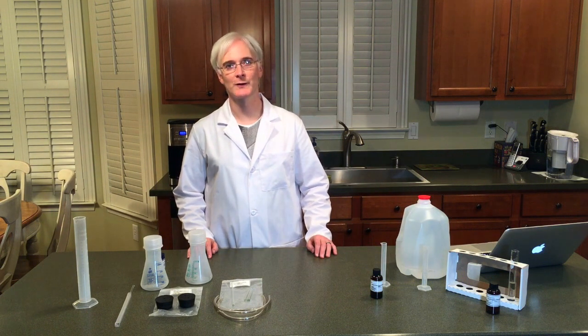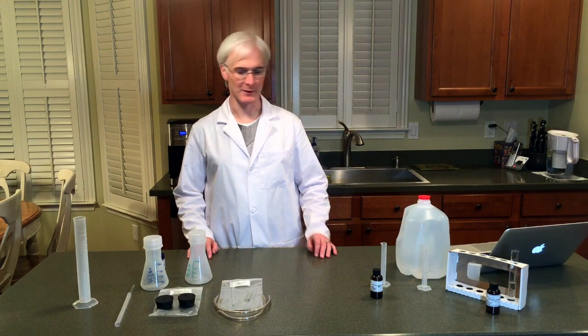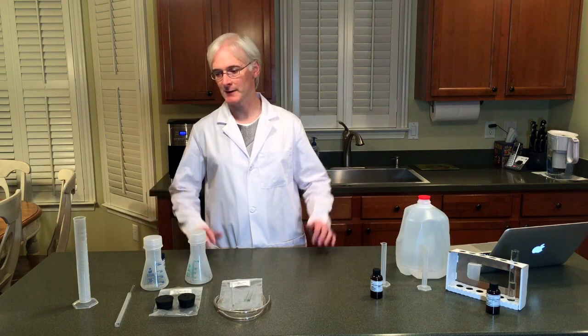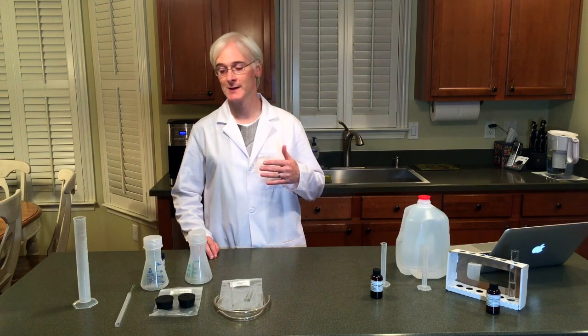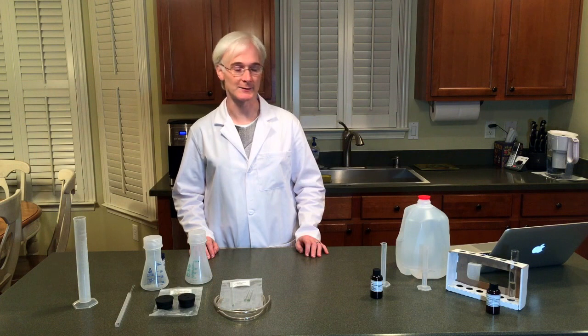Hello! Today we're going to work on the Reaction Rate Lab. As you can see, I've got everything set out here that I will need for the lab, so it's important that you go through the lab first. I like to only have what I'm going to use for the lab and then have access to everything else just in case.